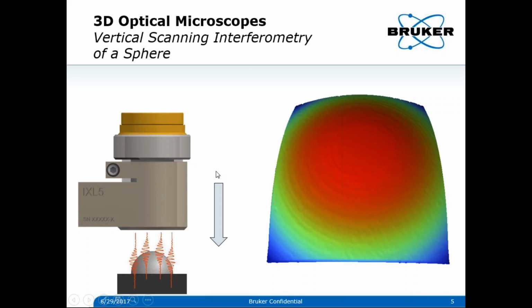We do have other webinars that talk about this interferometry technique. You just go to the Bruker website and look for that webinar, and it will talk about the interferometry technique by my colleagues. But today we are focusing on the analysis part, which is after capturing the data from the interferometer, then we do the analysis from there. Okay, thank you very much, Richie.